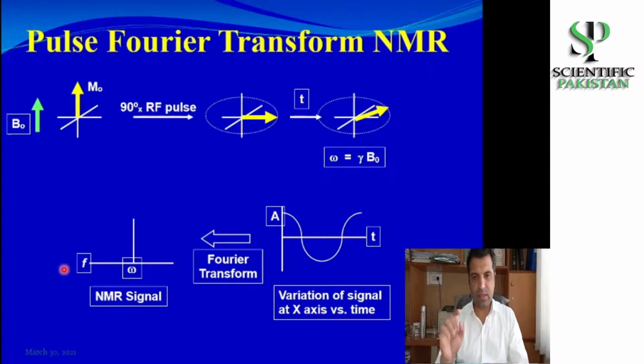We have discussed that not all of the protons might have the same Larmor frequency, and for that matter, not all of the protons in the molecule might have the same resonance frequency. But we just saw in pulse Fourier transform NMR that we are giving a pulse at a fixed frequency. For example, the magnet inside your machine is operating at 7.05 Tesla. What does that mean?